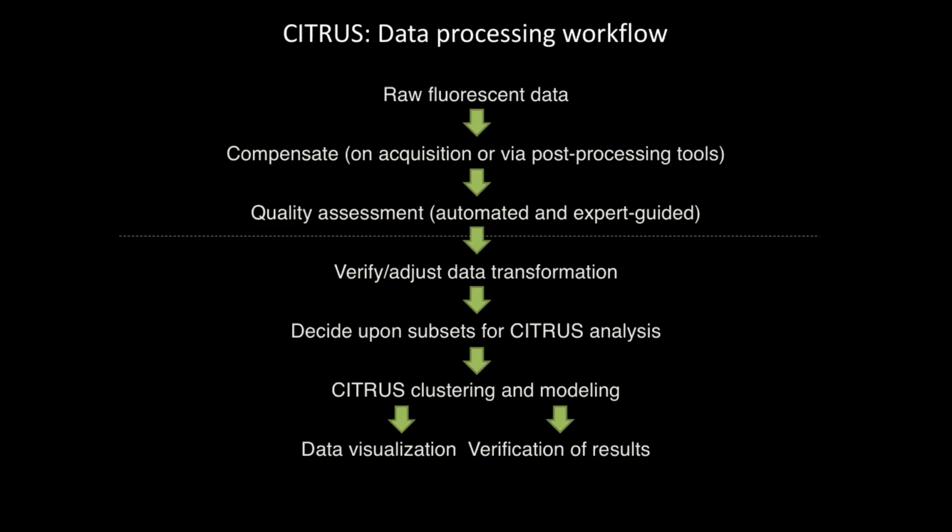But we cannot cover everything with one parameter selection, right? And as always with any modeling, we try to verify our Citrus results with alternative approaches. So we don't take it from Citrus straight to the submit-to-Nature button, right?